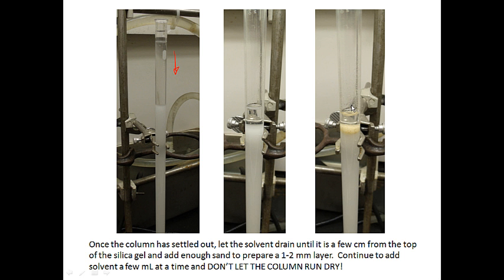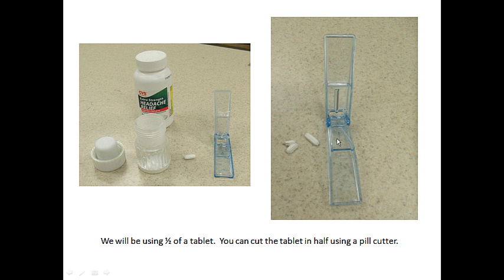Okay, now you're probably not going to want more than about this much solvent in your column at any one time. So we add a few mils at a time, but you never let the column run dry. By running dry, I mean that this layer of solvent drops below the top of the column, because at that point the silica gel will get air bubbles and channels in it, and that's what we wanted to avoid in the first place.